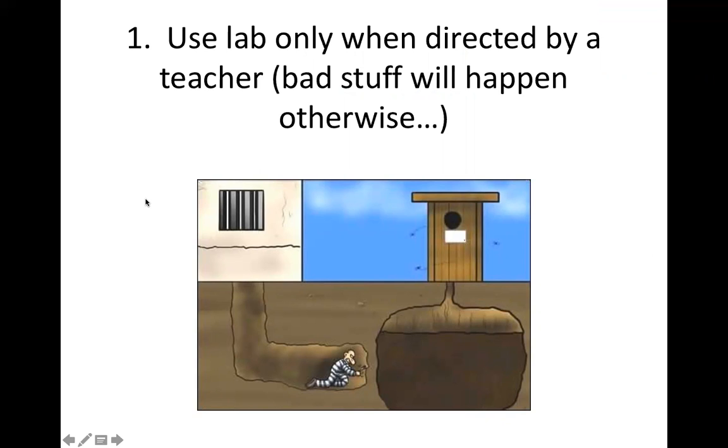Okay, that's better. So the first one, as it says here, is that you only use the laboratory when directed by a teacher. Although you are interested or you have an idea of an experiment that you want to do, please do not do it without the approval or supervision of your teacher. Since you will be doing the laboratory experiments at home, only do these experiments when you are supervised by an adult.